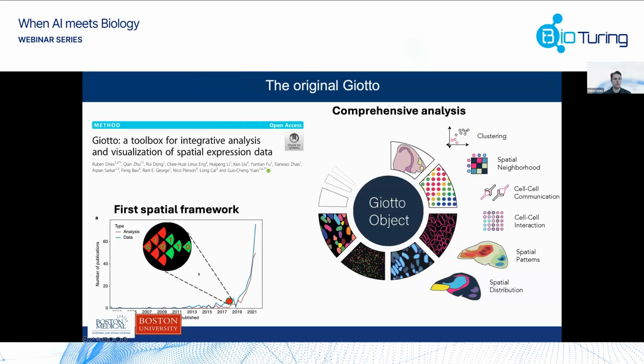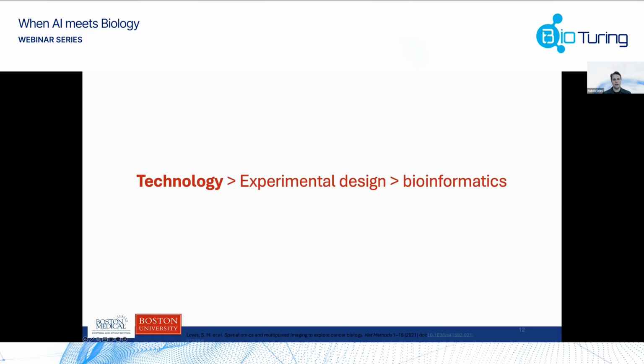And the reason I started early, before anyone else was doing it, is that we had the opportunity, or the fortune, to work together with Dr. Long Cai, who is at Caltech and who developed seqFISH and seqFISH+, which is this really cool spatial multiplexing technology. So I just want to highlight a little bit why we couldn't just stick with the original Giotto, and we had to develop something from the ground up, something completely new.